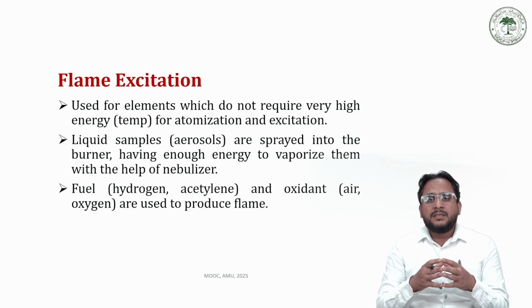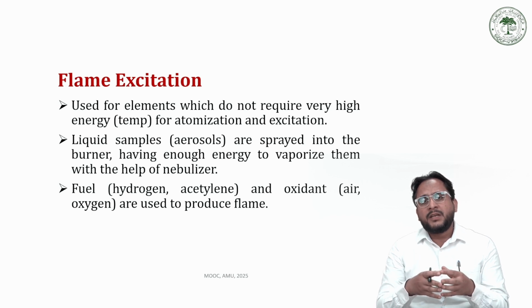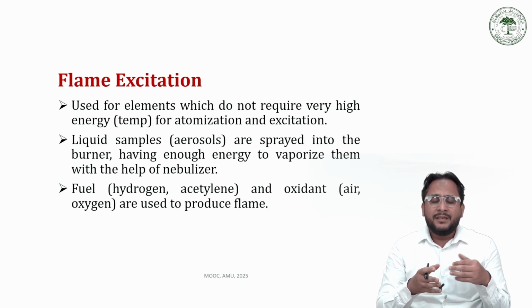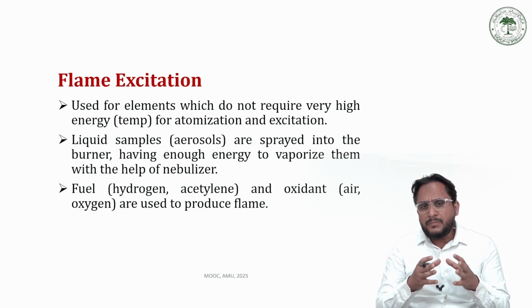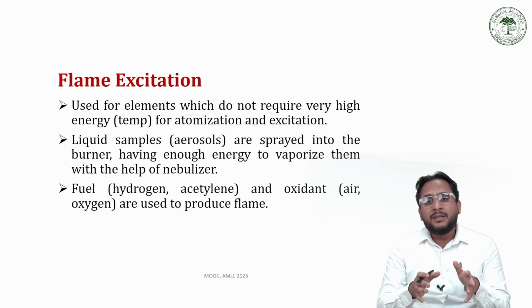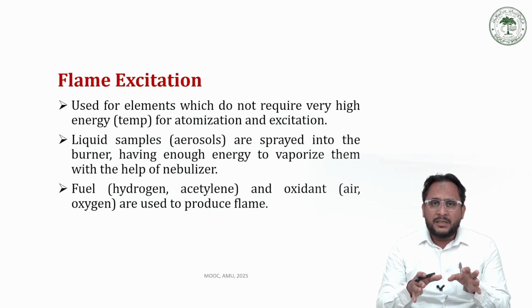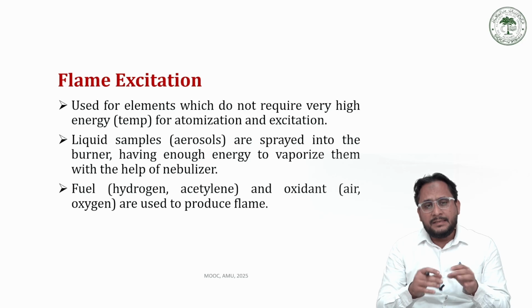This flame excitation, as you all know, if we compare the flame excitation or the direct aspiration method with the electric arc or spark or even the plasma technique, the flame excitation sources have limited energy compared to the temperature we can achieve in the electrothermal process or in plasma techniques. Therefore, flame excitation is limited to the metals that can be ionized easily.